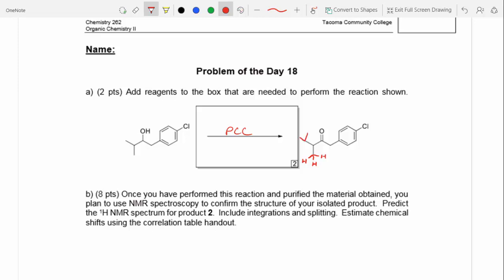So if we look at this isopropyl group, we could say that this isopropyl group can spin around like a helicopter blade, right? Because that sigma bond can rotate. So they're essentially occupying the same space on the NMR timescale. So all of the red protons will be equivalent. What about this guy? Are there any others like it? No. So that's unique.